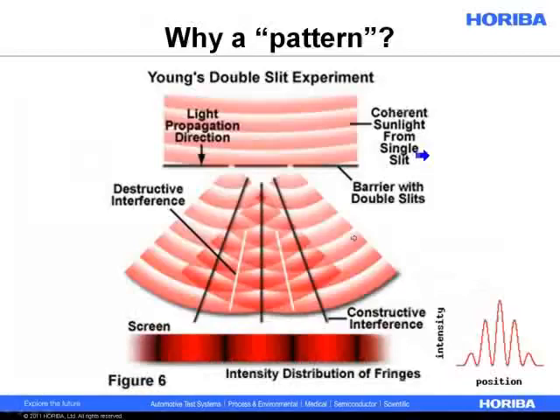So why do we call it a light scattering pattern? I talked about this maybe two slides ago. Essentially, you have light impinging on some edge. It creates waves. The waves overlap. And one way of visualizing this is an intensity distribution of fringes. So you'll have some areas where the waves overlap constructively, and you'll get maximum light intensity. And some areas where the waves overlap destructively, and those will be local minima. So you get areas of bright light, areas of almost no light, and it repeats in a uniform way if the particle is, again, well behaved and of a nice, clean shape.